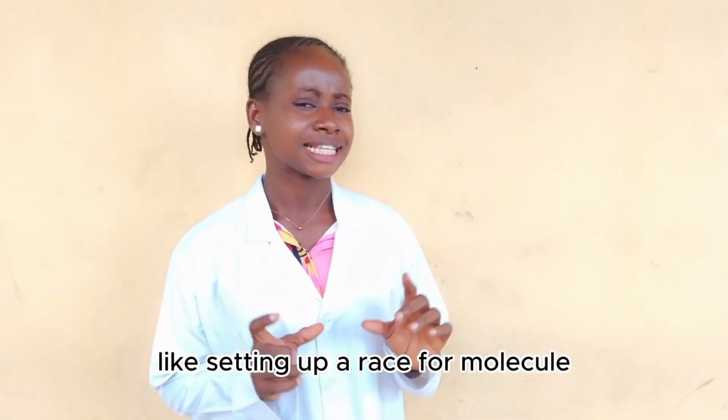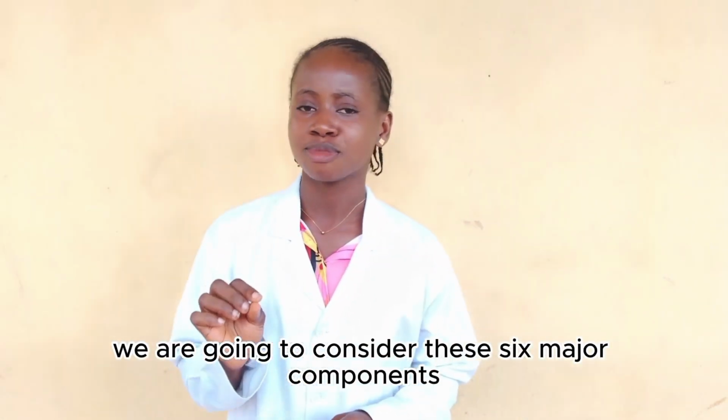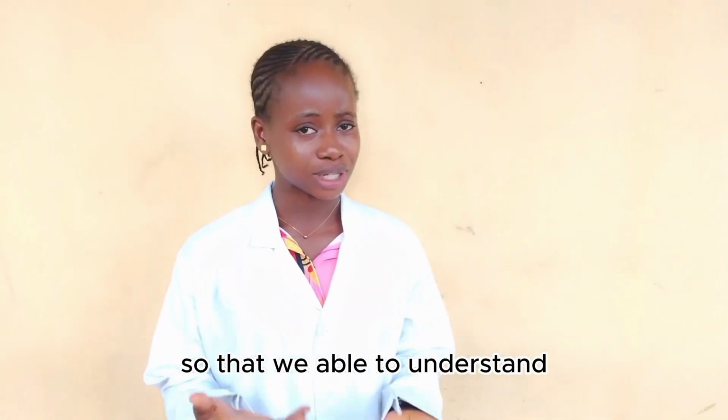Still speaking on how to run agarose gel electrophoresis. Now think of it this way, like setting up a race for molecules. We are going to consider these 6 major components. I'm going to group them into 3 so that we're able to understand.